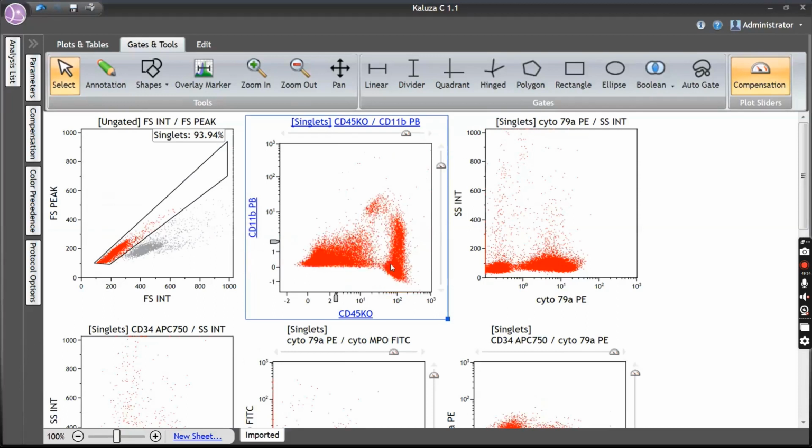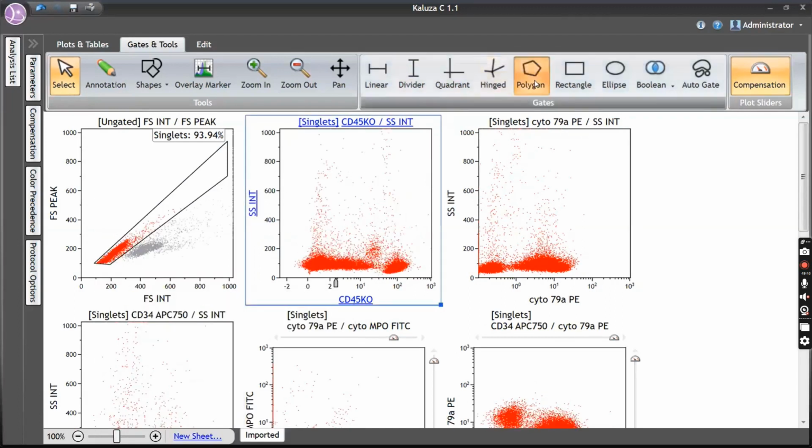See, with compensation you get a pointed thing like this. Variable expression is different, it goes from the negative to the positive quadrant, it just trails. This is the problem with compensation. So, side scatter. Let me gate the populations.